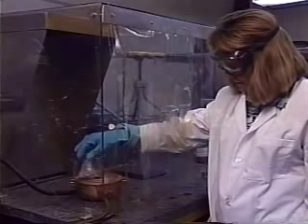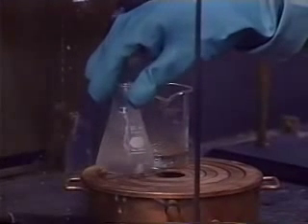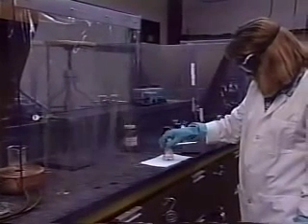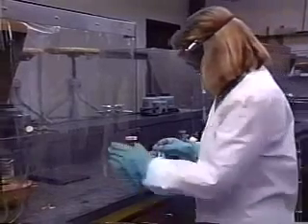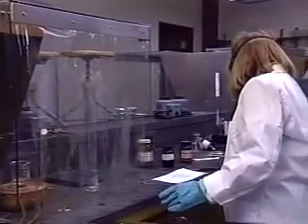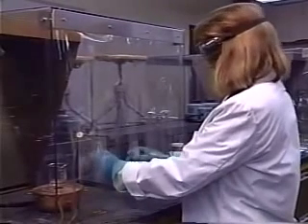When the solution is clear, remove the flask from the steam bath. The norite pellets can be removed from the solution either by decanting or by transferring with a Pasteur pipette. To decant the solution from the norite pellets, carefully pour the solution from the flask into a clean flask, leaving the norite pellets behind.